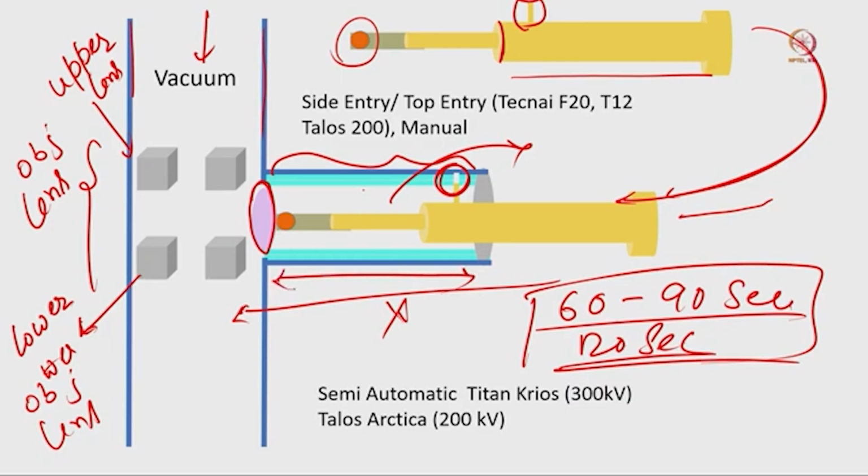When this goniometer is clean, with no moisture, then this entire goniometer will rotate almost 180 degrees. So, now you can see there is a rotation of this entire holder. Now, this pin and entire system is moved in the opposite direction and then it will go inside.